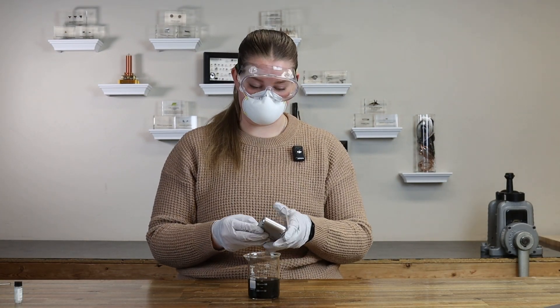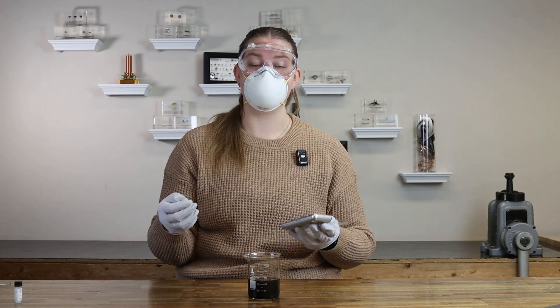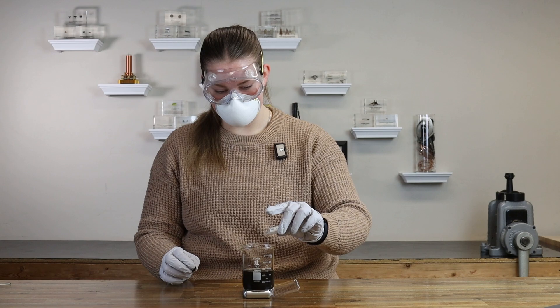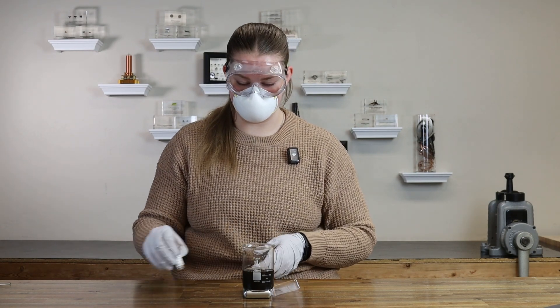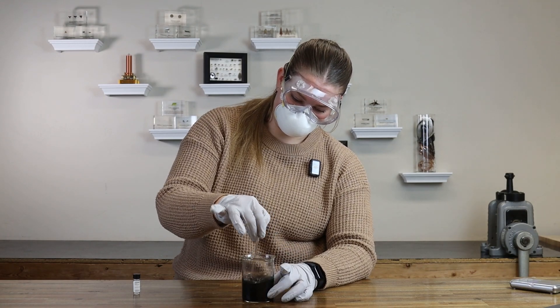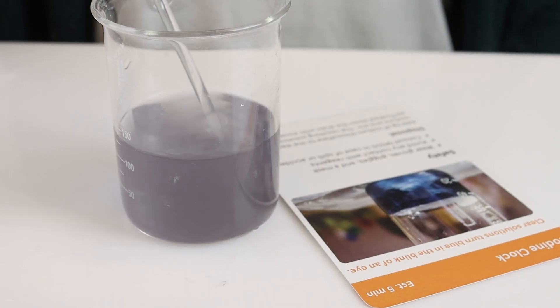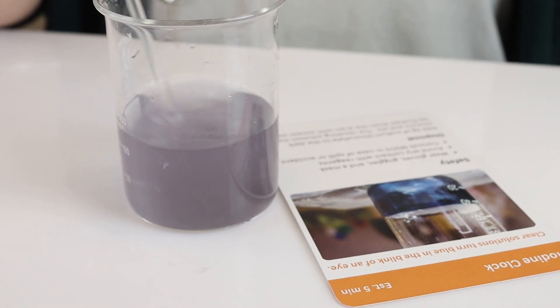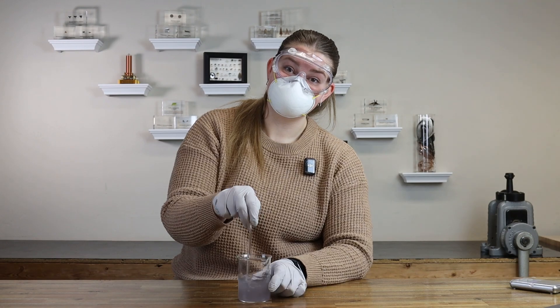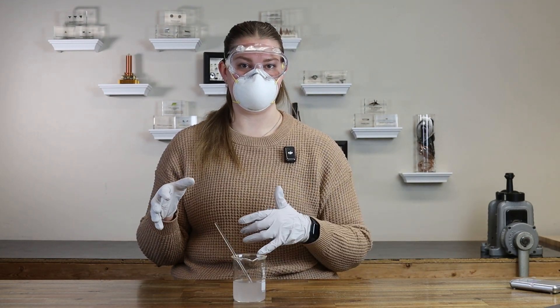Another thing that we provide you with is a way to dispose of it — to neutralize the reaction so you can pour it down a drain with water. You're going to add two grams of the sodium thiosulfate. This is kind of cool; this is like an experiment by itself, and I'll show you why. You can see it start to lighten up and clear up again. I'm going to go ahead and clean up real quick, and then we can talk a little bit about the science behind this.